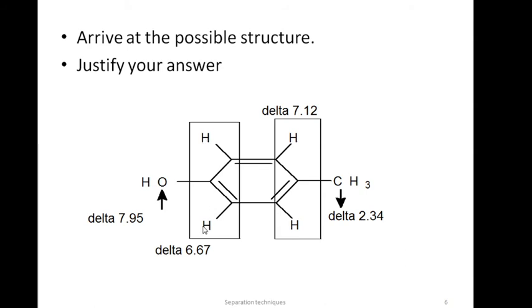And this has 1 proton. So it's going to give you a doublet, and the intensity will be really high. The peak intensity will be high because both are going to give you one single signal. Fine, so you are supposed to assign the delta values for that particular molecule.